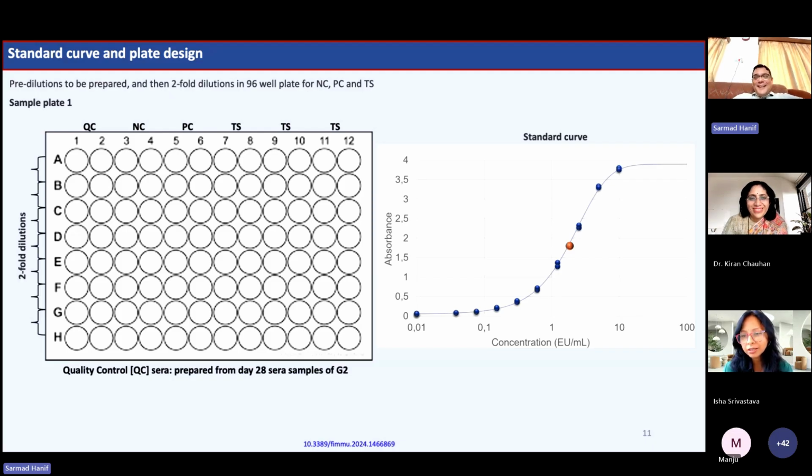It actually depends on the kind of antigen you have. If you want to identify the concentration, the estimation of the concentration of the antigen against the disease for which you are developing, for example, a neurodegenerative or any other disease, then for antigen concentration and antigen estimation, it will be competitive ELISA.